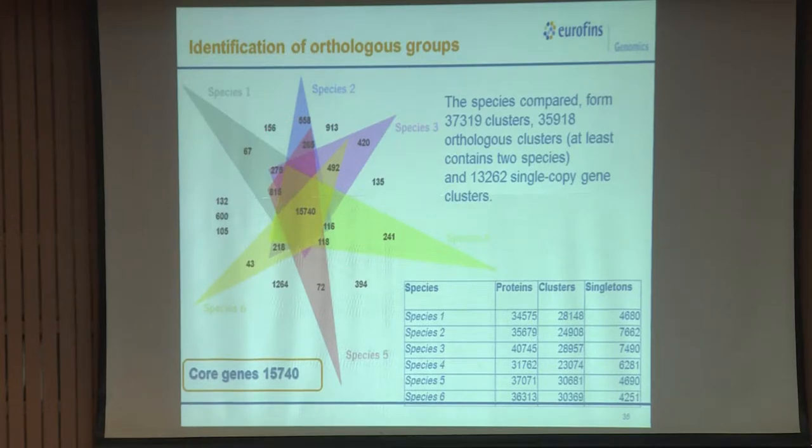Based on your study and your interpretation, you can identify, and you will also come to know the clusters. For example, this many sequences were reported, this many clusters were formed, and these are the sequences which are singletons, meaning they have not clustered with anything. That means they might be falling outside the criteria. Based on this graph, we can identify the unique species-specific genes and the core genes, and based on this we can also generate a phylogenetic tree of various species.